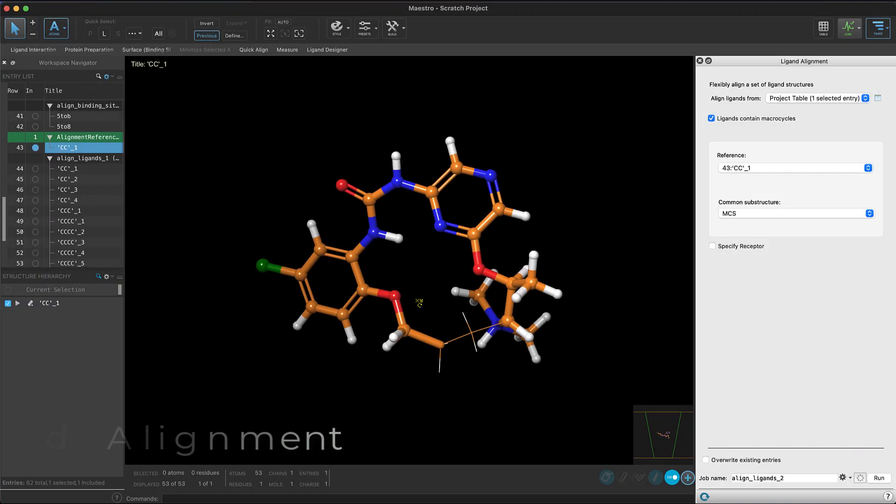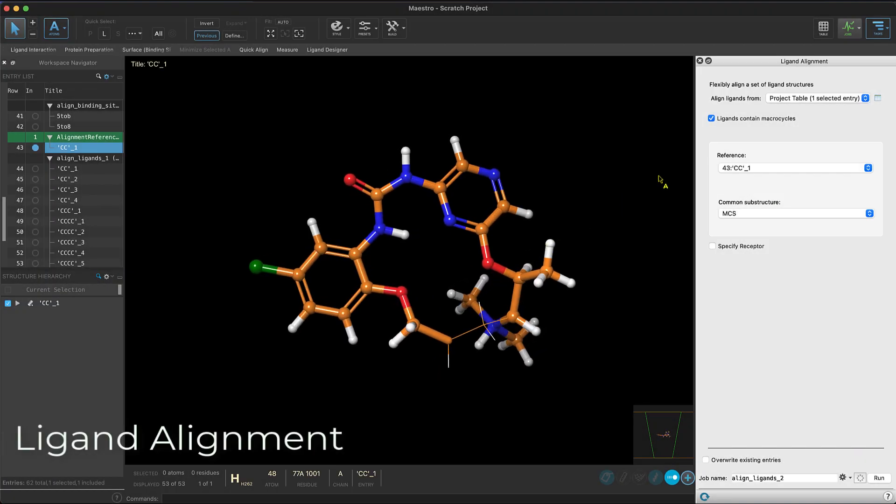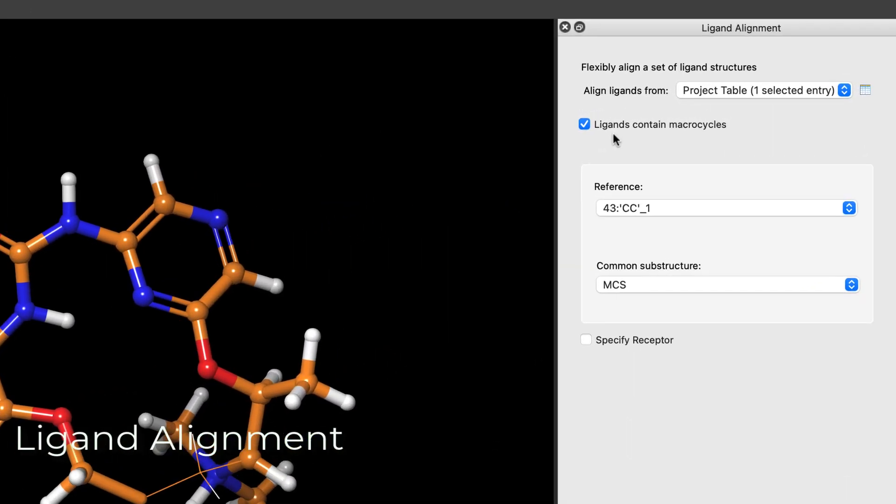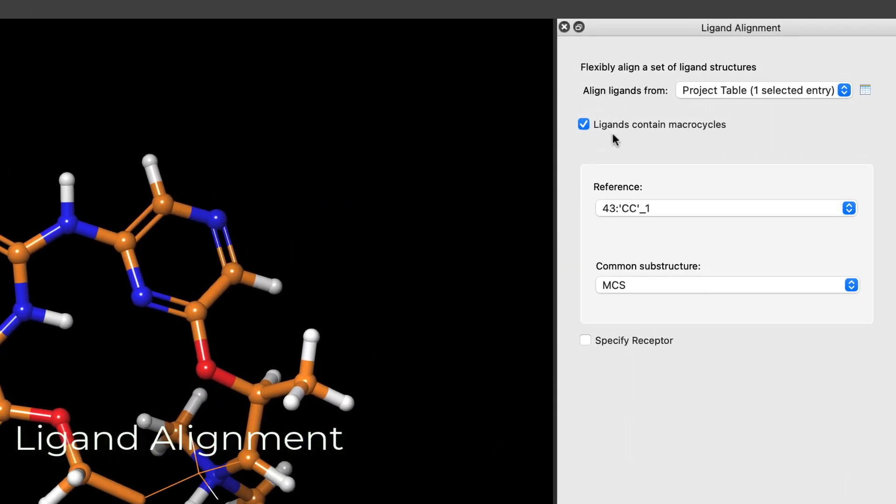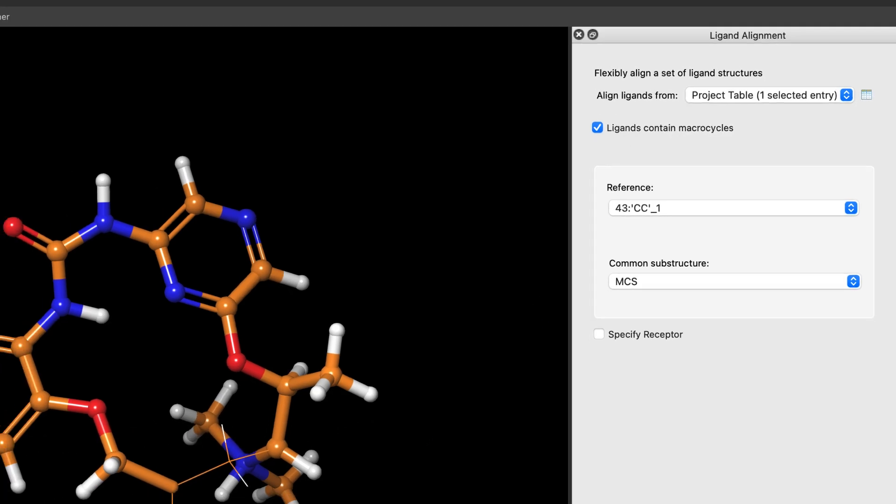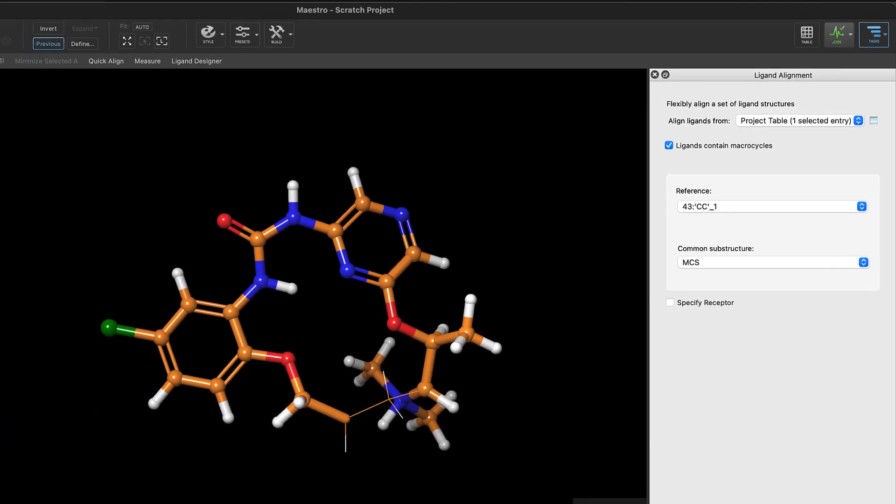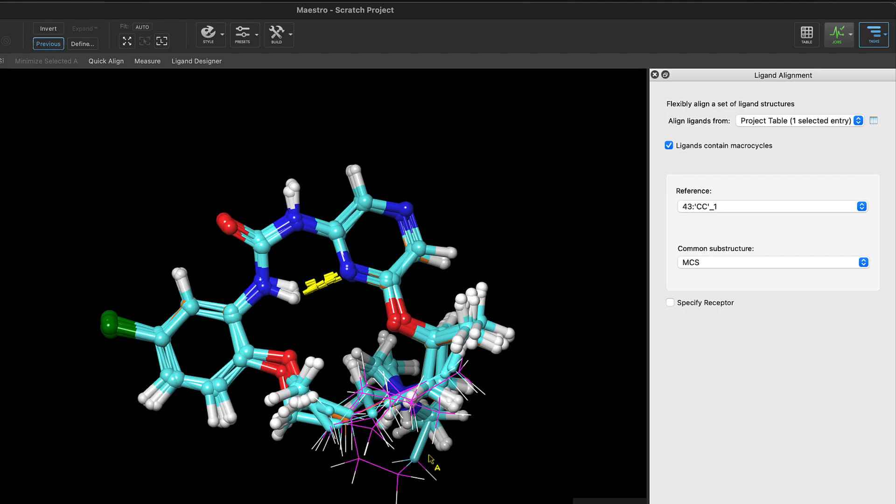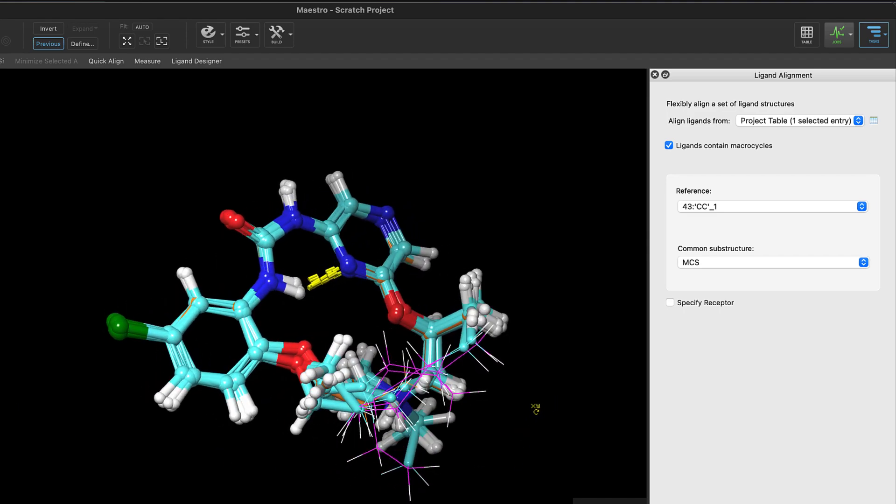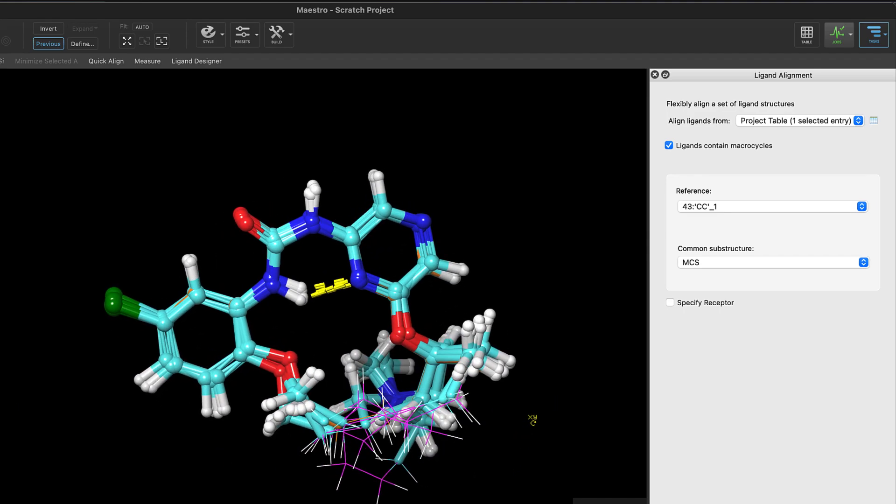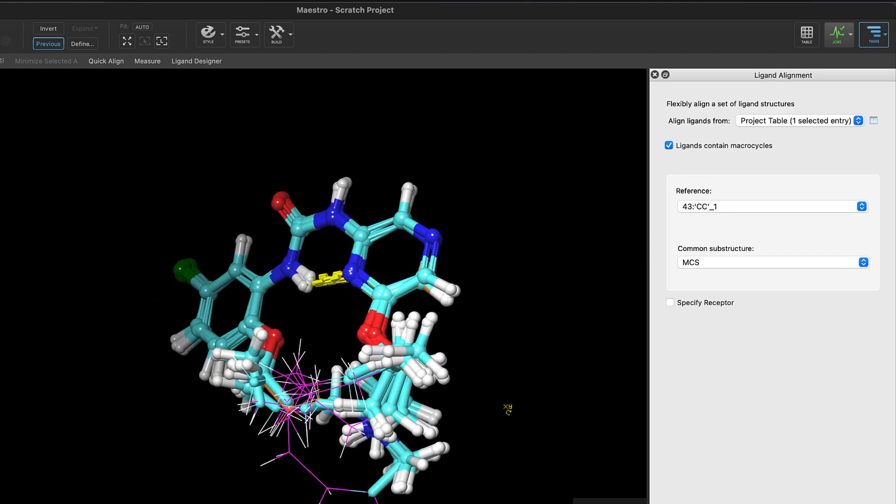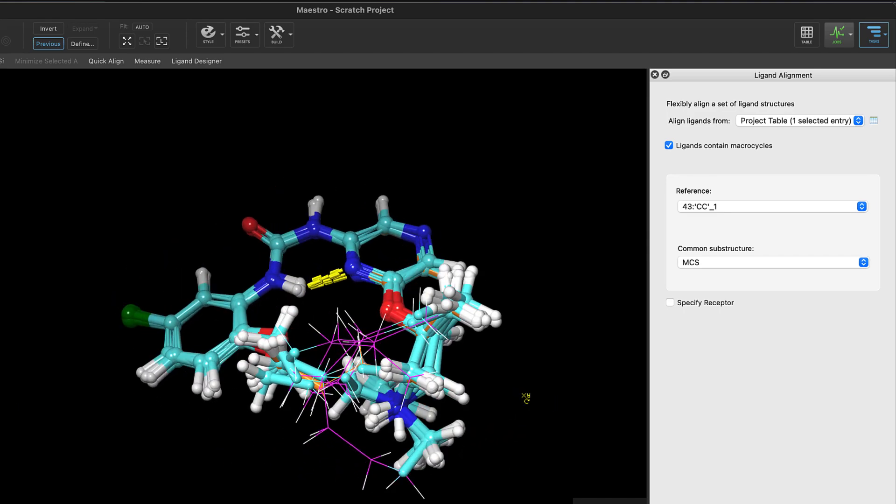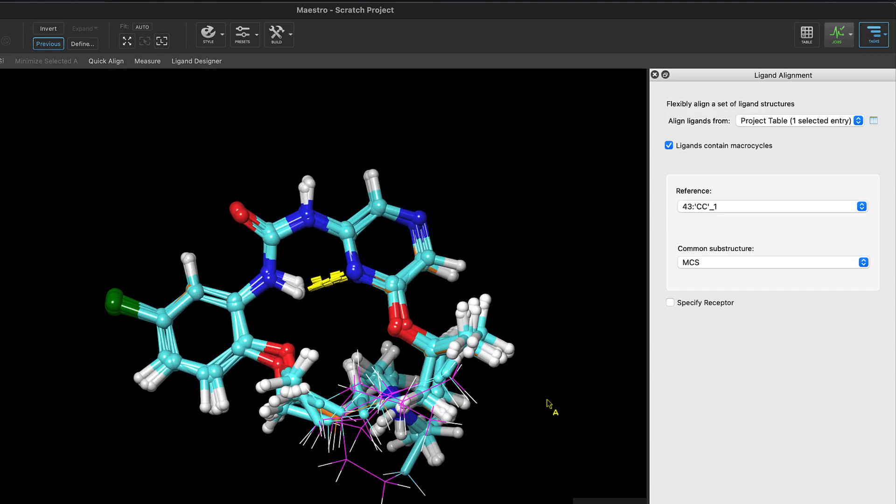In the ligand alignment panel, we see a new option to flexibly align macrocycles to a reference ligand conformation. The macrocycle method employs a stochastic approach that tugs atoms to their optimal alignments and requires an MCS partial match for some of the macrocyclic ring atoms.